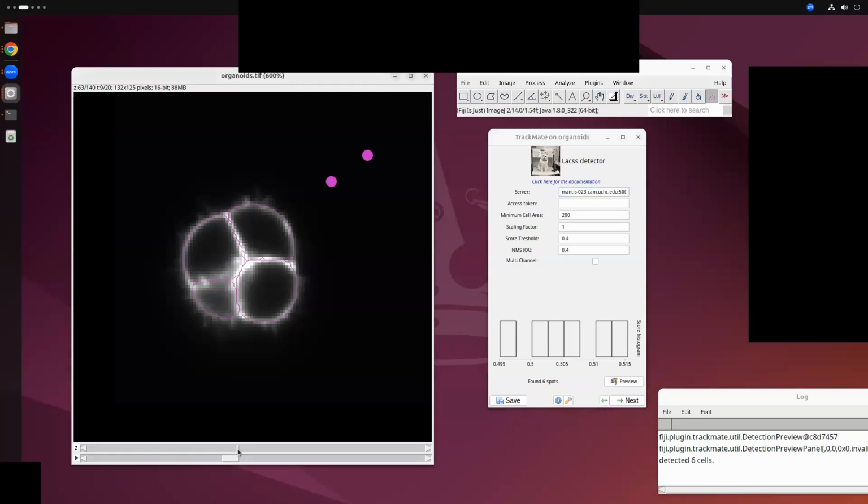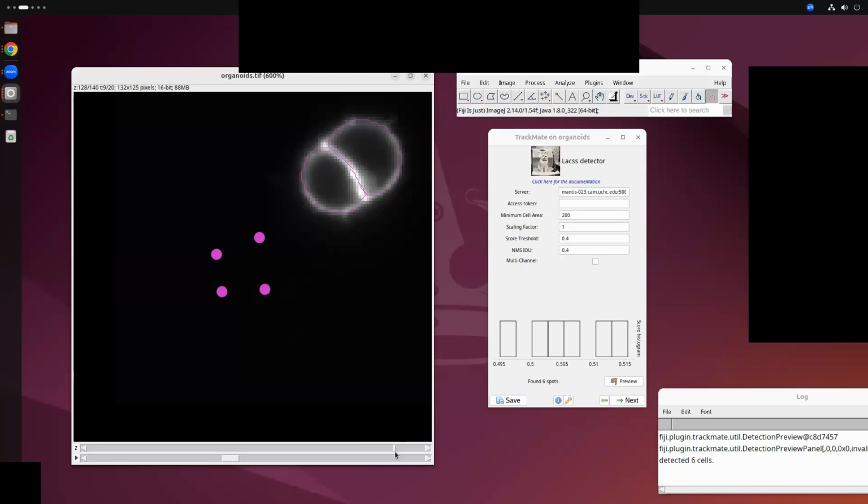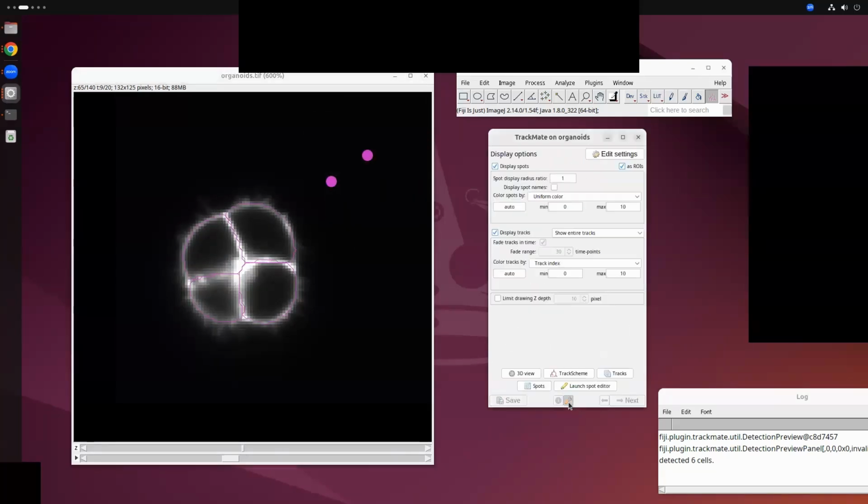But if you scroll through the slices, you can see it will change to a real segmentation when you go into the real places where cells are. Typically, at this junction, for 3D segmentation, I prefer to recolor the coloring scheme.